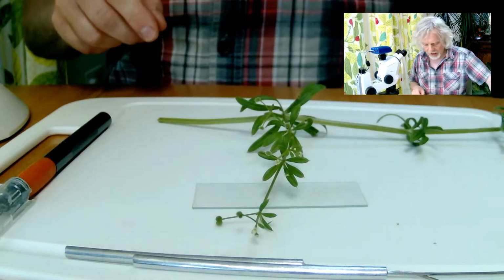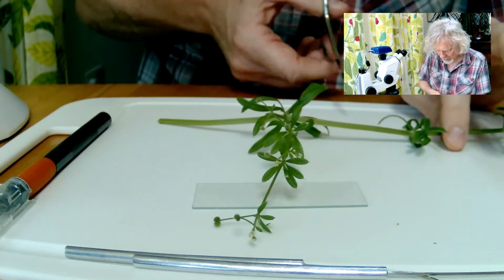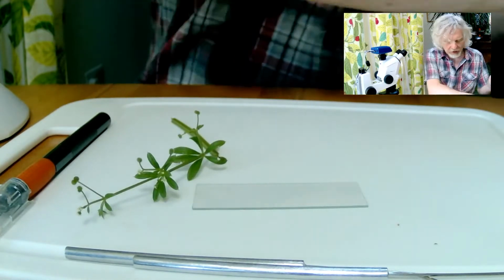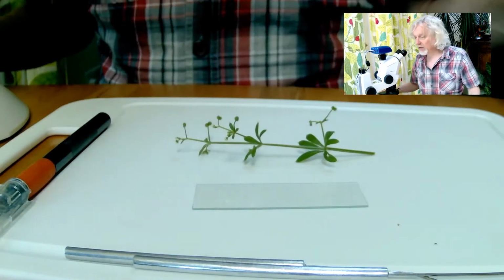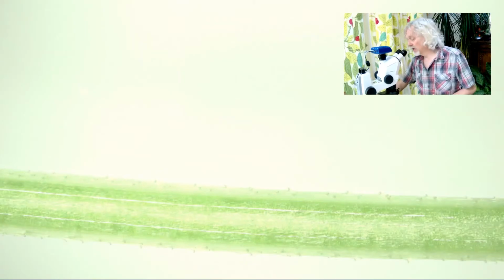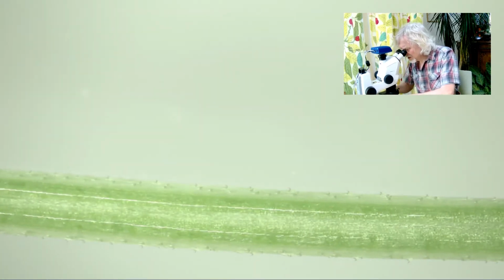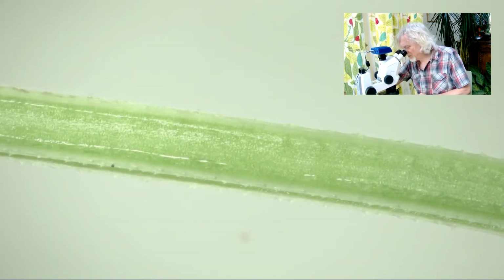I'm going to actually chop up a little bit. Let's take a bit of the stem here, this bit of stem here, like that. I'll cut that there like that. And we don't need that bit. So let's start with a bit of stem. That's going to go under the microscope there. And I'm going to adjust my exposure whilst I'm doing this. Let's set the exposure on that, and let me focus on that. There we go. Ooh, spinning around. So it just looks like a sort of stick of rock or something, I don't know. Slightly peculiar plant.